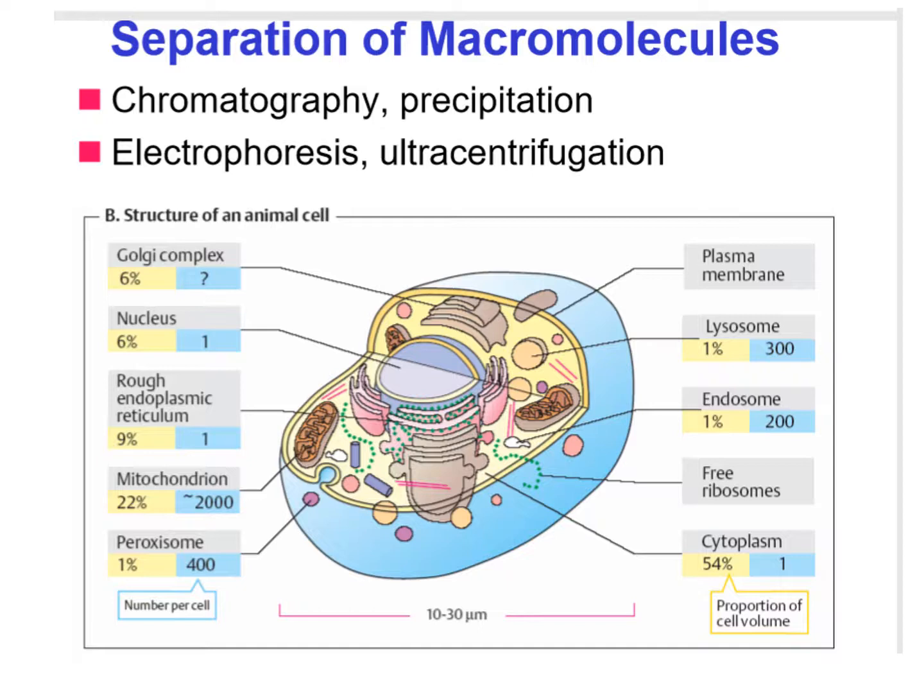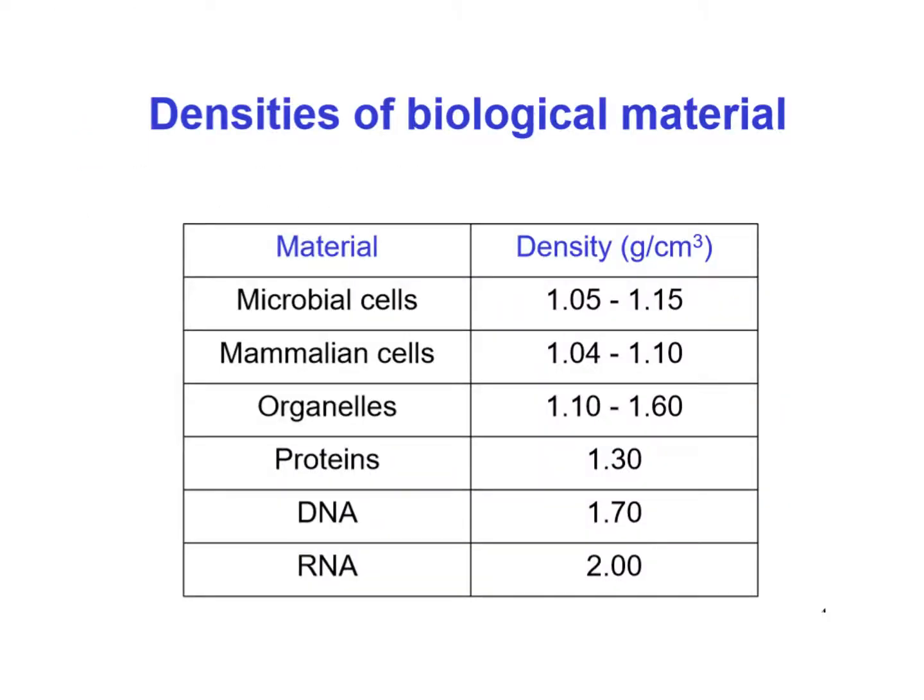You can think of the separation as a big step first, and then the materials can be further worked on. So you split it apart, right? Bread, you've got the crust and the center, and then you can work further down if you can separate it. Organelles, cells, materials have a certain density.